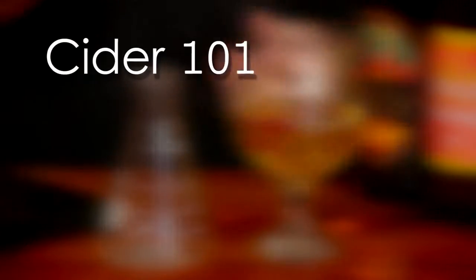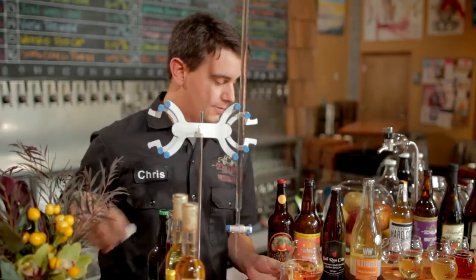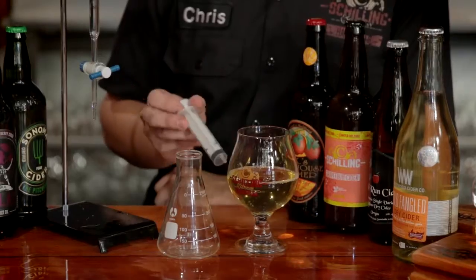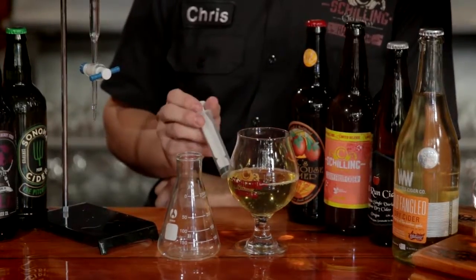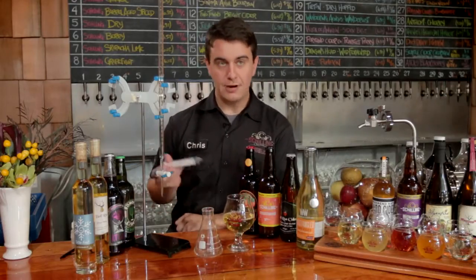With a given sweetness, you want to have an expressive and balanced acidity, and this is measured as titratable acid. I have just filled our burette with 100 milliliters of sodium hydroxide solution. We will also be using the Two Towns Bright Cider. It's important that there's very little CO2 in this, because carbon dioxide in solution acts as carbonic acid, which will throw off our acid reading. We want to know about the malic acid naturally in the apple and the cider, not those introduced through carbonation.